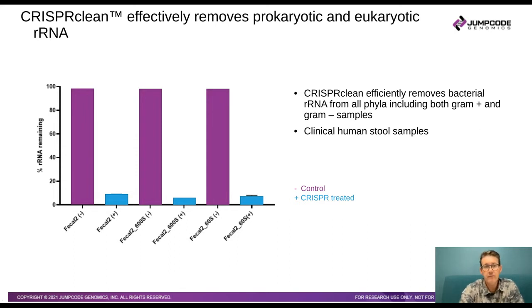And next, we wanted to take a look at, okay, if we've now removed these fragments from a library, and ultimately these fragments now don't take up real estate and form clusters on a flow cell, that area on the flow cell is now available for other informative fragments to form clusters and ultimately sequencing reads. What kind of increase in sensitivity of detection would we obtain with that?